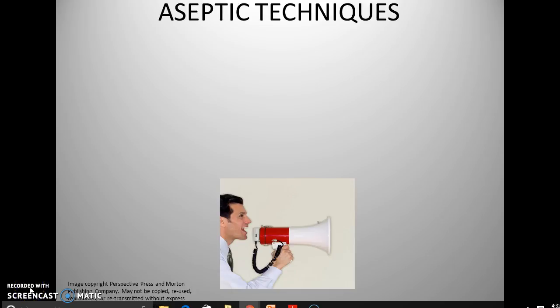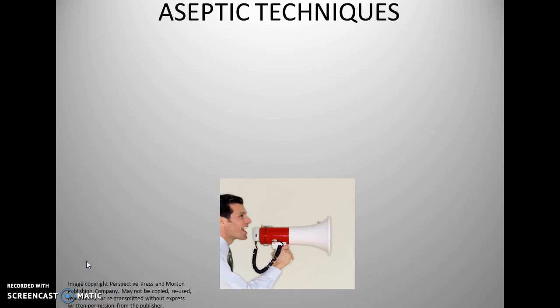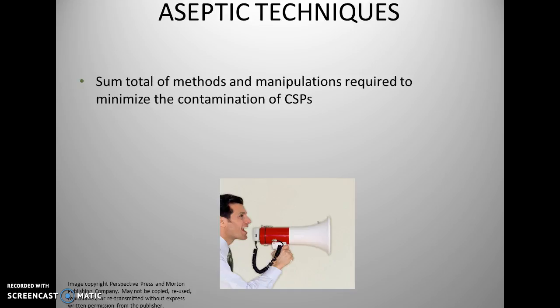Okay, we are back, and again, we are looking at Chapter 9, Parenterals, Compounding Sterile Formulations. Here, we're using and talking about aseptic techniques that should be done within the hoods and cabinets that we just finished talking about. Notice we have an individual with a megaphone shouting it out, indicating that you must be able to follow these particular techniques. If not, you lead to challenges for the patient. Okay, so we are definitely going to go over these techniques.